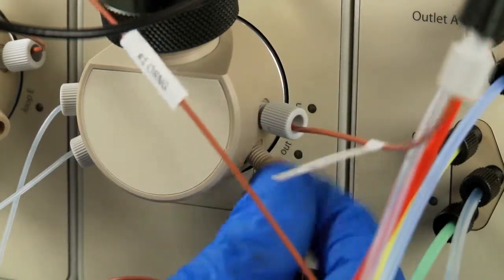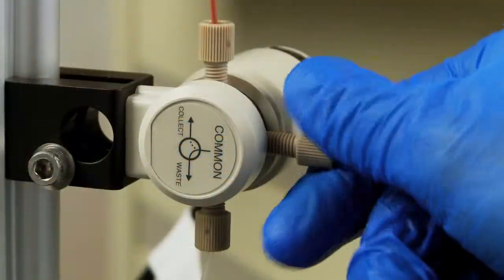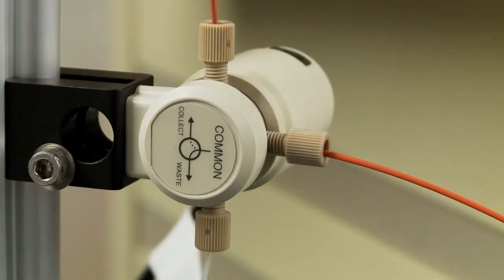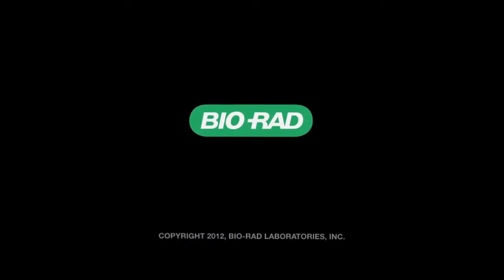Connect the other end of line number 4 into the common port on the BioFrac diverter valve. Follow the instructions for the BioFrac to complete its plumbing.